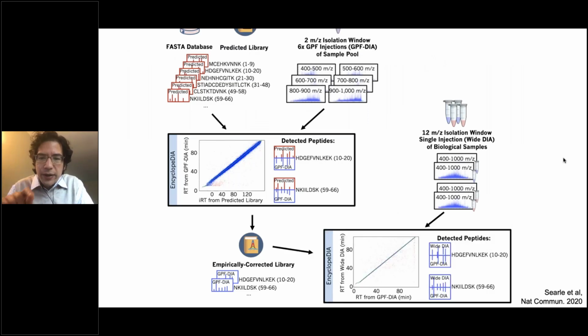This can be a nice advantage when you're searching single injection DIA, where you would be monitoring a single injection experiment or experiment set and mapping peptides that you identified in your library to these single injection experiments. Since everything is acquired on your instrumentation at exactly the same time using DIA methods, it's very easy to line those spectra up and identify them.